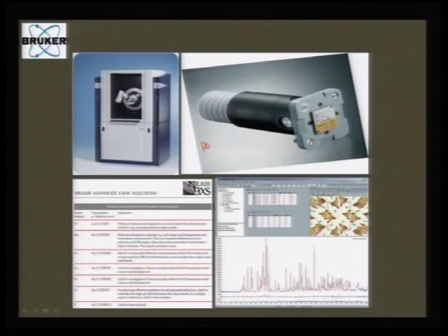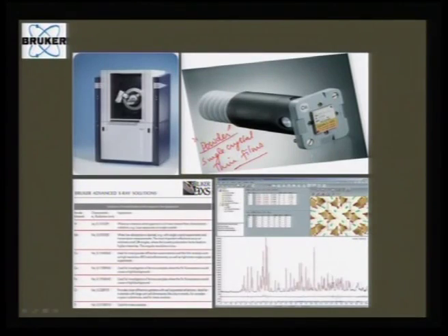We have powder, we have single crystal, only for studying single crystals, and presently we also have those dedicated for use with thin films, because the settings for studying thin film patterns are different from powder. Therefore, you need such a precise assembly. So, these are some of the different versions, and I will be mostly talking to you about powder diffraction.